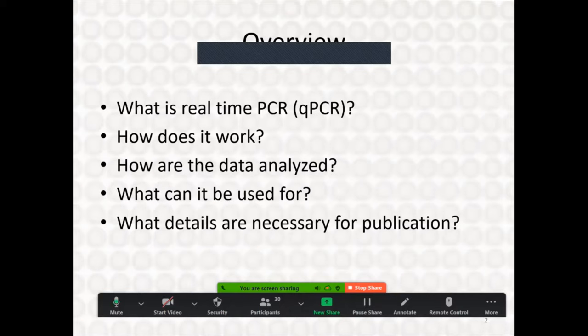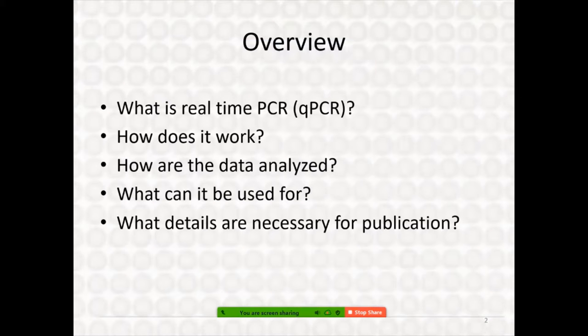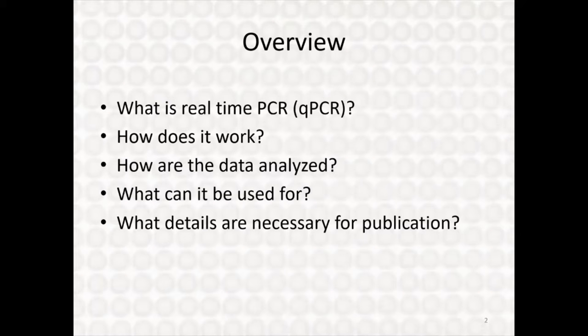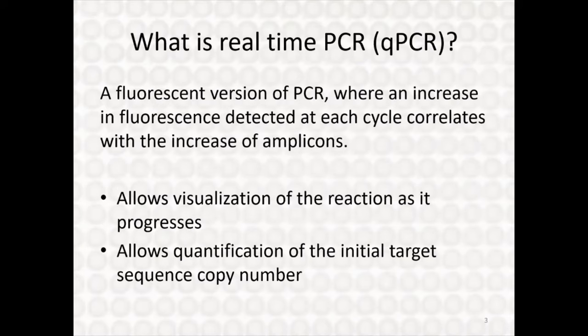I'm going to talk about how real-time works, how the machines work, and how the chemistry works. Then we'll go through some data analysis, look at the different kinds of data you can analyze and different methods for doing that, talk about what real-time can be used for, and finally what is necessary if you're going to publish your real-time PCR — what details you need to include in your manuscript.